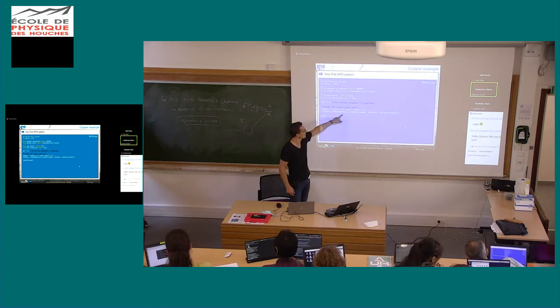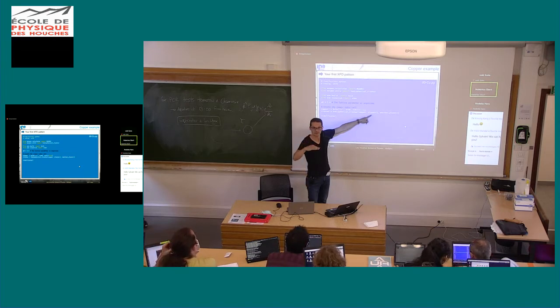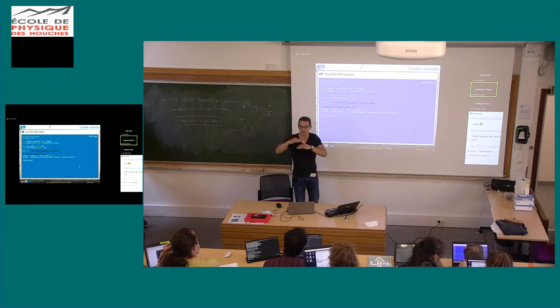And then to use the hemispherical cluster function, you will provide this cell, the copper, so the basic pattern, and it will produce a cluster according to that pattern. Here is the number of planes that you want in your cluster. Here I want 3 planes. And here is the emitter plane, meaning where the absorber atom is located in the cluster. Numbering starts at 0. So it means that I have a 3 planes cluster and my emitter is totally at the bottom.